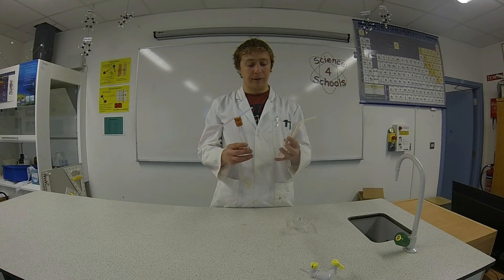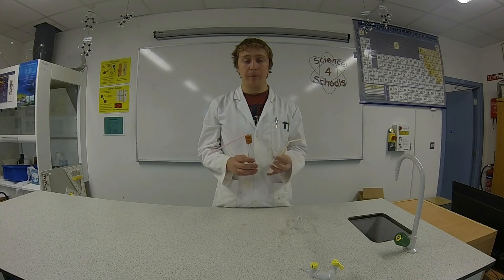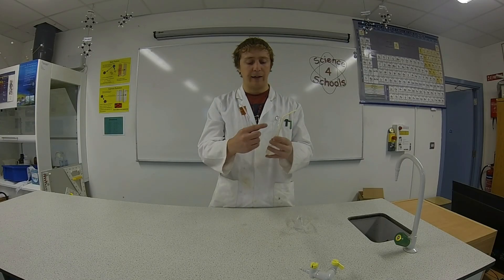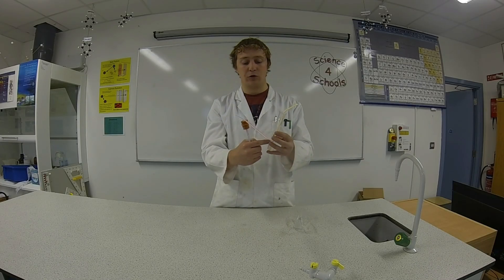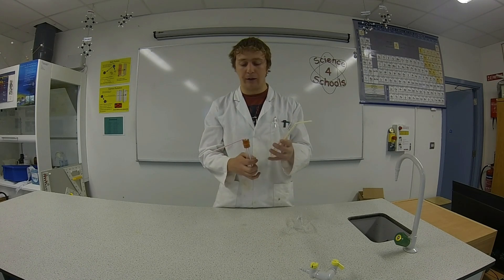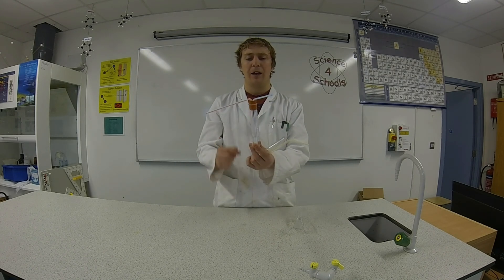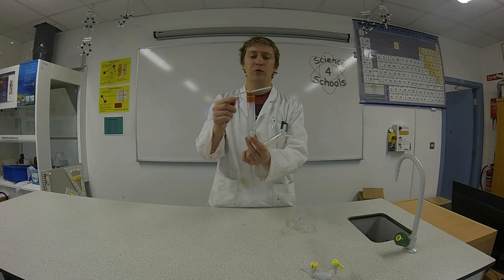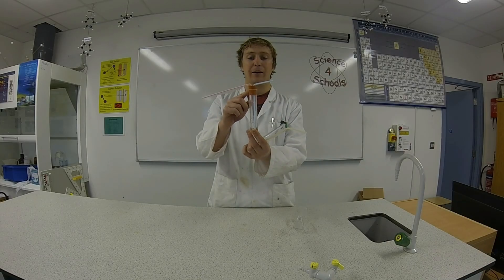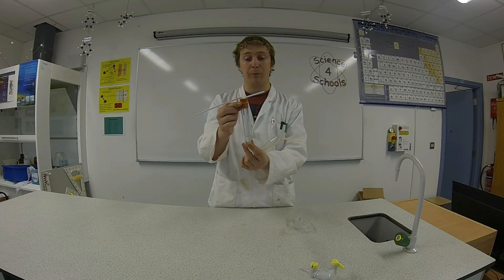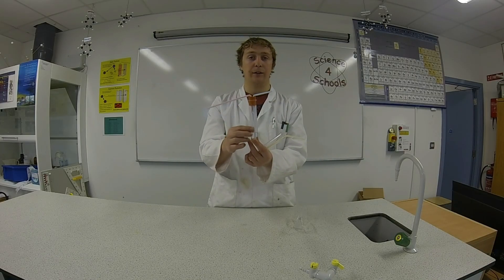We have them in a couple of test tubes here. One test tube just has a straw going down into the lime water. The other test tube has two straws in a stopper going into the test tube.